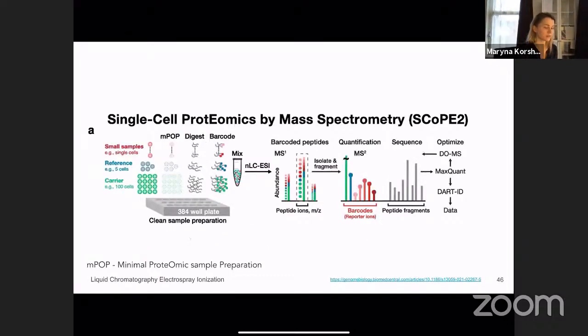So yeah, this method, SCoPE2, is based on manual selection or separation of cell suspension into 384 well plates, and then preparation of the plate content, first of all for liquid chromatography in order to split the different products and different proteins into fractions, and consequently mass spectrometry, where you look into the relationship between size, like molecular weight, and charge, and identify your target molecules there.